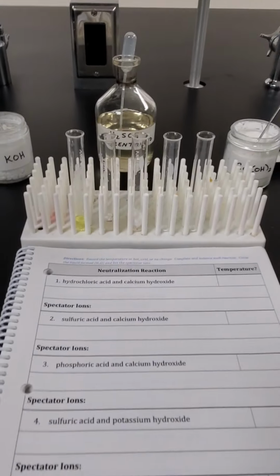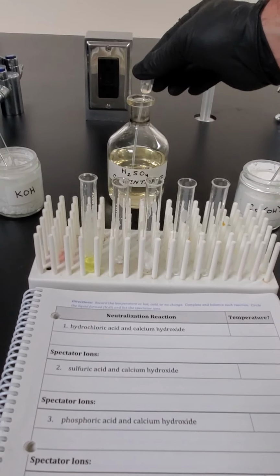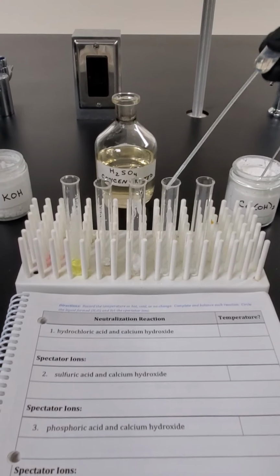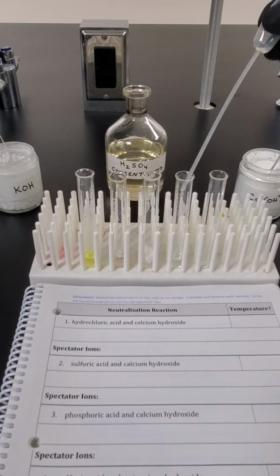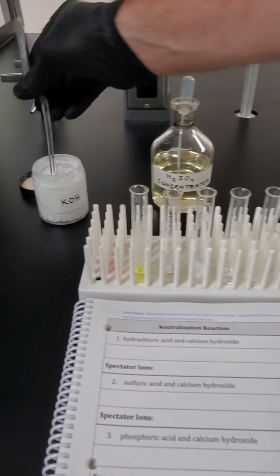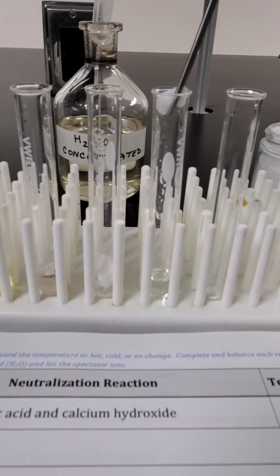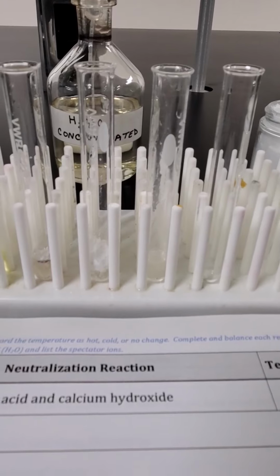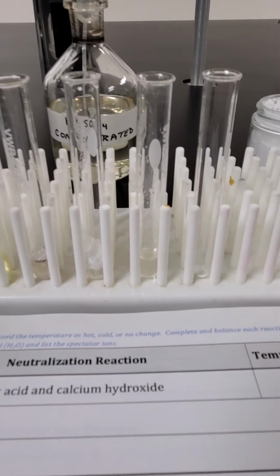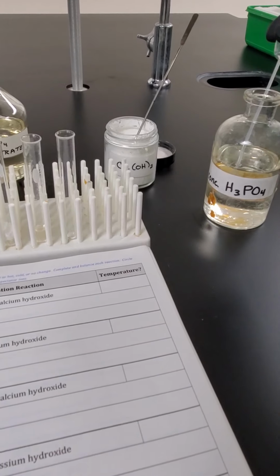Two left, we have sulfuric acid, so battery acid coming up. This would be the syrup that would eat your pancake. And now we have potassium hydroxide. These are in pellet form. So let's grab a pellet. Bombs away. Definitely angry there. And last one, phosphoric acid. The other death syrup over here.